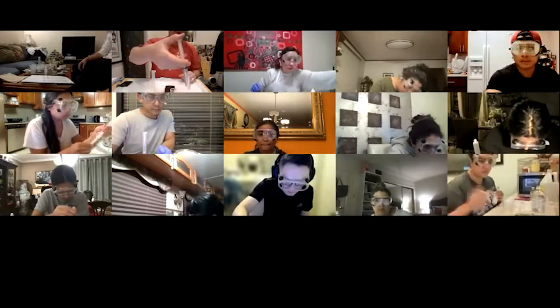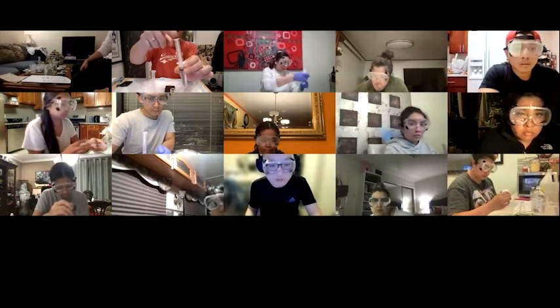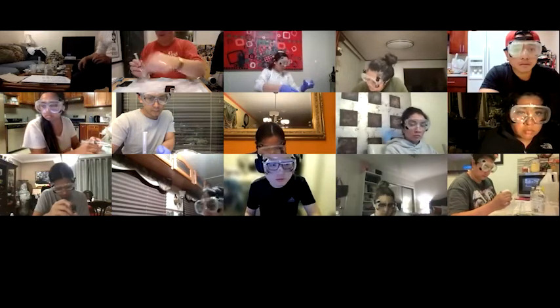Now, do not just put your thumb there and just blast away. You want to just sort of gently push from here, not from here, to add your 1/2 mil at a time.